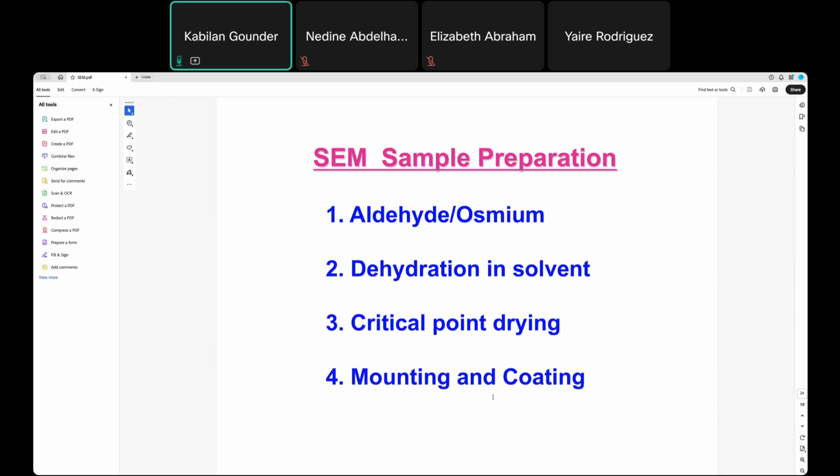Now we understand that the scanning electron microscope is important for the detailed structure of the external surface, that is, the topography. On top of that, you will get a lot of other signals that will help you get more detail, not only the structure, but also electrical current, compositional elements, atomic numbers, and X-ray details. This kind of information will help to get more data on your samples.